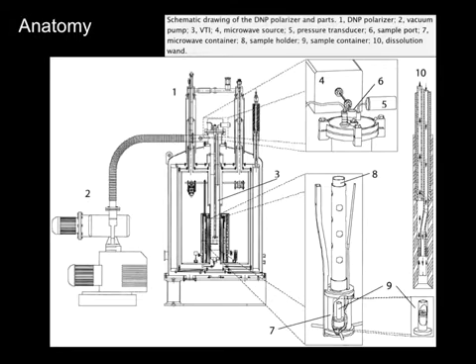So that's really probably the key modification. But then, of course, there's also several other modifications. There's the microwave source here, number 4, which sits, this is a zoom in of this area here at the top of the VTI. And so this is a microwave source that's introducing microwaves into this bore cavity here and irradiating it and allowing the transfer of polarization.